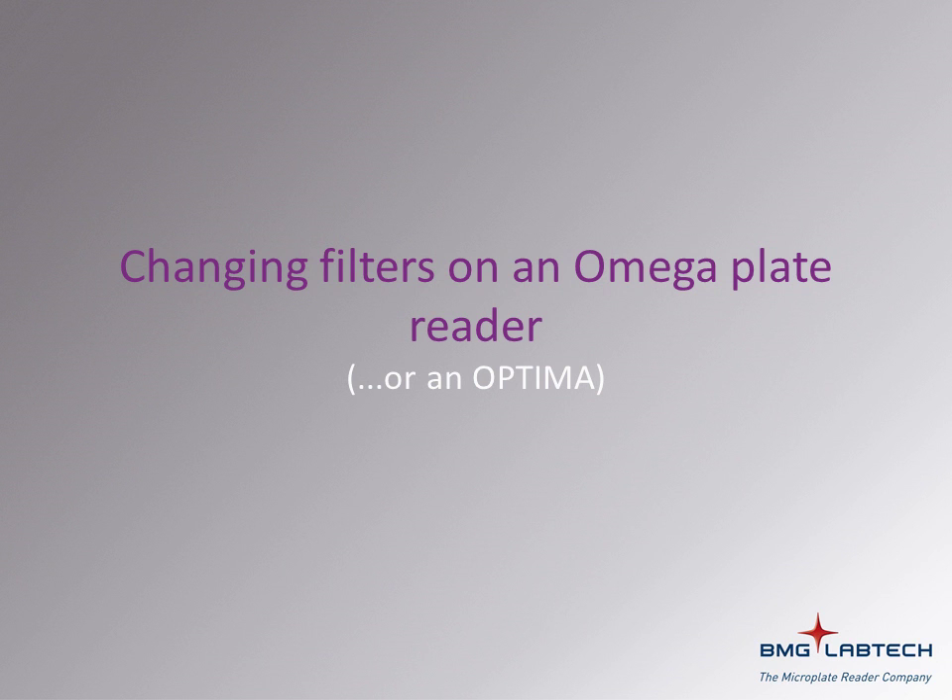In order to get the most from your BMG Lab Tech Omega plate reader, you will likely need to purchase new filters for new assays you wish to try. In this tutorial, we will see how filter wheels and filters are accessed so new filters can be added.